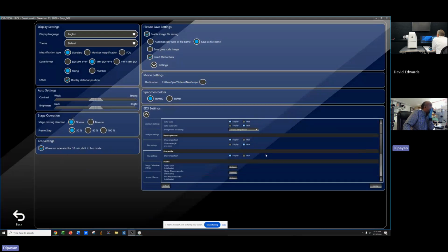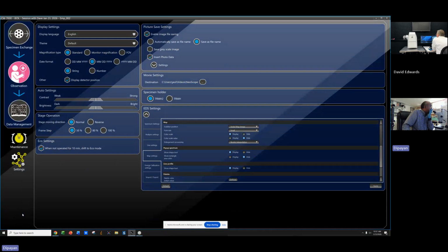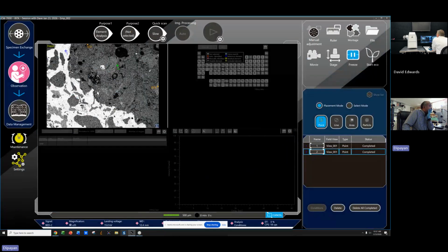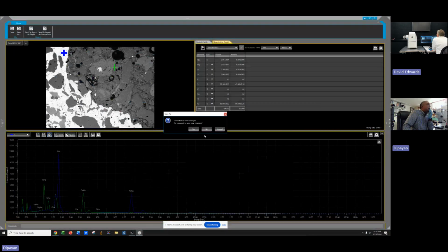Let me go back to where was I? Oh, not that. I'm sorry. I had to go to layout. How do I go to? Okay, so I had to go back there. Management. Yep. Not that one. That one.